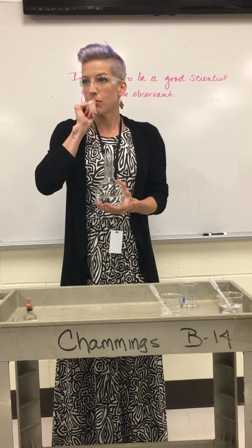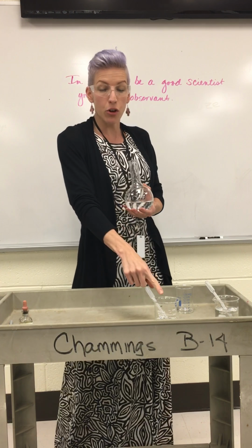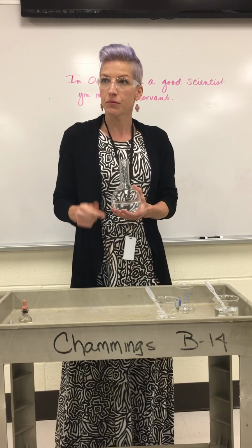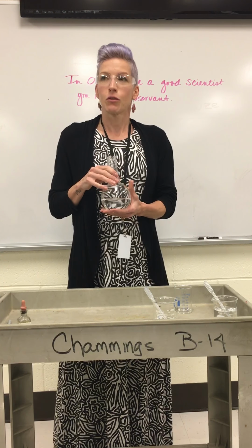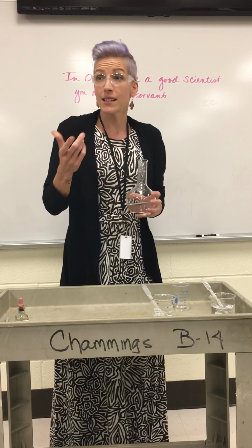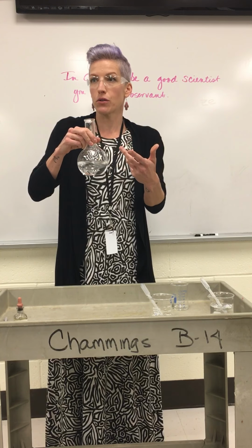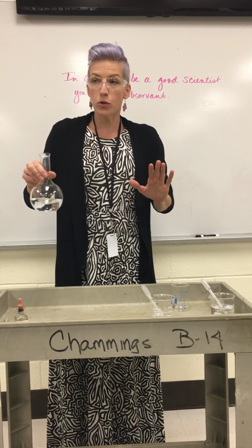What were you gonna say? Is it the B that was clear or A that was clear? B turned it pink. Yep. The more A would outbalance the pink. Right, so it seems like amounts of things matter, right? Intensities, how long, right, I have to do this before it disappears, right? Kind of thing. You want to do anything else while I do this?